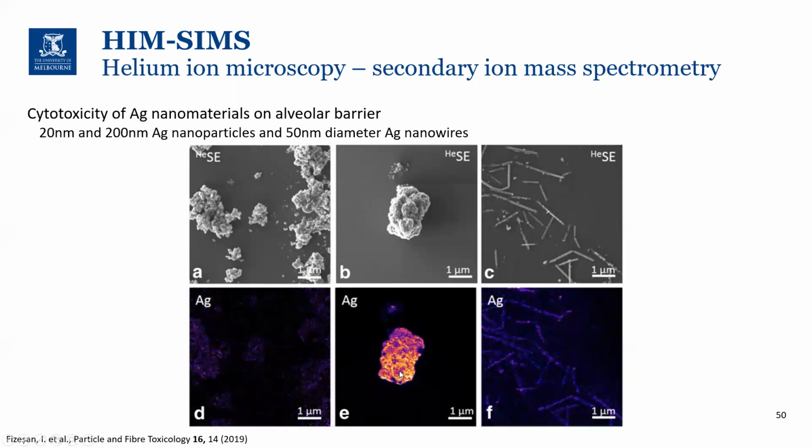Now, this image you could probably achieve with a very good EDX system. This one you probably could as well, might be a bit of a challenge. This one within EDX, I'm not so sure, because you have to remember these are 50 nanometers wide, but therefore also only 50 nanometers deep. So getting that kind of very shallow signal from an EDX might be a challenge. The only other technique that I would think of that would do that readily would be something like a scanning Auger microscope. So this is very, very interesting, being able to see incredibly small nanoparticles on a surface with minimal interaction from the substrate beneath.